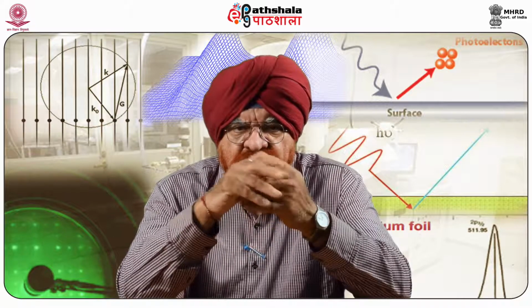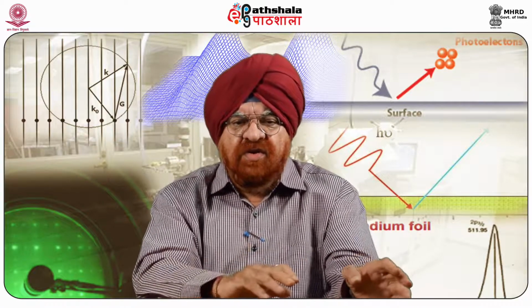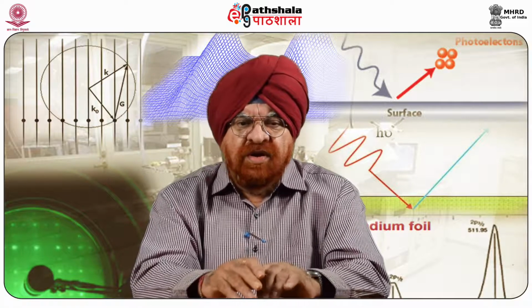The materials under investigation include thin and thick film coatings, ceramics, composites, glasses, synthetic and biological membranes, metals, polymers, and semiconductors. The AFM can examine any rigid surface, either in air or with the specimen immersed in a liquid.